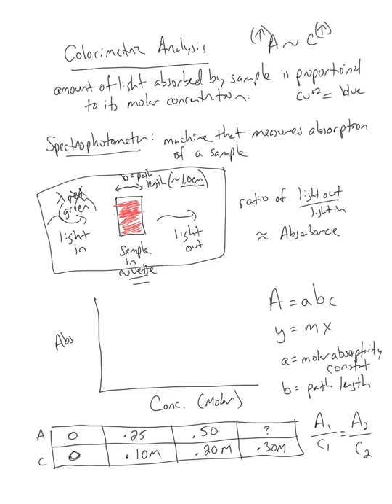So we would send green light through the sample, and the spectrophotometer measures how much light comes in and how much light comes out. That ratio, the machine will do a logarithmic function on it, and that'll compute an absorbance. So the darker or the more concentrated the sample, the more light it will absorb. And by graphing, if I do multiple concentrations, multiple knowns, like down here, a 0.1 molar concentration, a 0.2 molar concentration, 0.3, as I graph that and put it in the machine, you'll notice as the concentration increases, so does the absorbance. It ends up being a beautiful linear relationship.